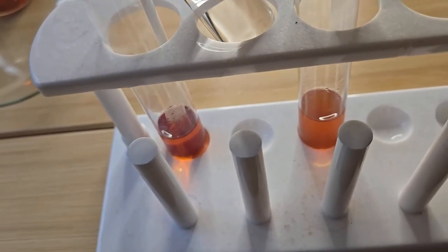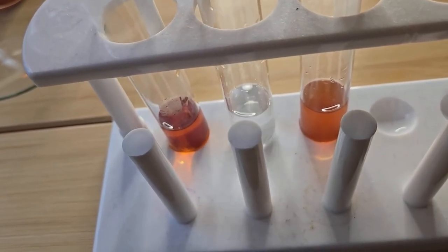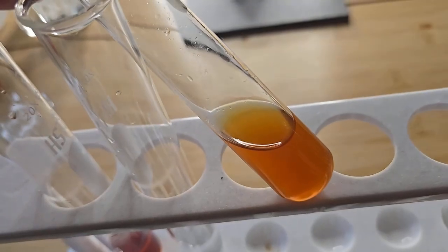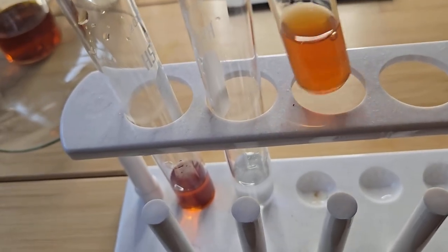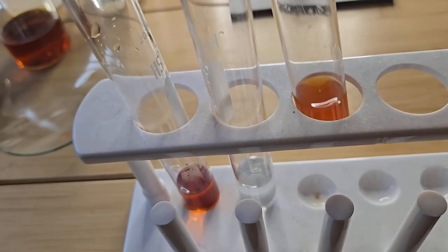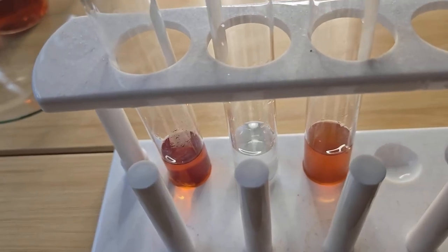So there's no reaction occurring in the sodium chloride tube, but you can see this is going cloudy. And this is because the sol is slowly precipitating out. And this is caused by the multiple charges in the aluminum sulfate.